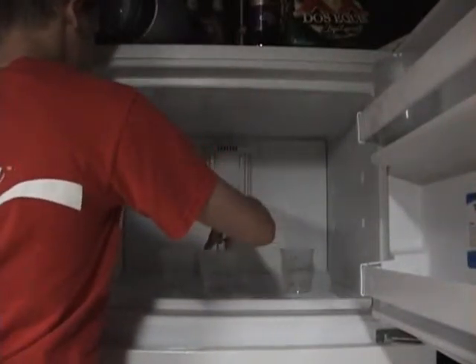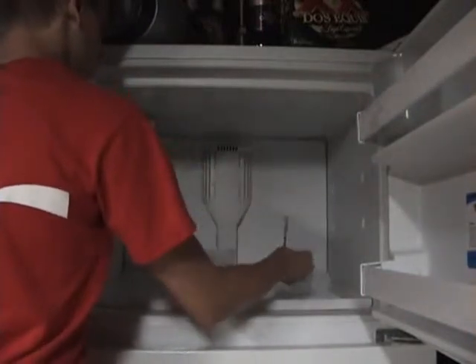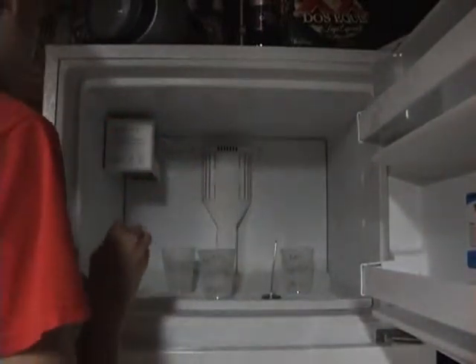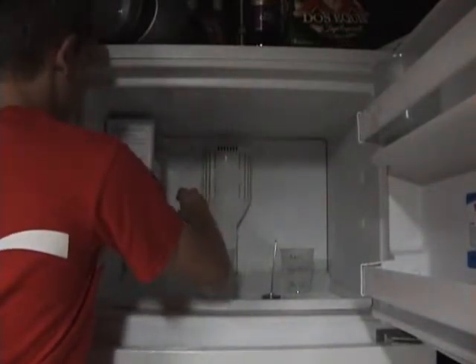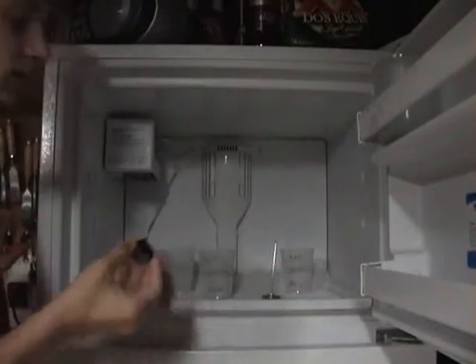They're just still water. So the sugar solution is frozen at 30.9 degrees Fahrenheit, which is 1.1 degrees Fahrenheit below the freezing point of water. That's already proof that adding the sugar has changed the freezing point. Next, we're going to do the boiling point, but we're going to come back when the other two solutions have frozen.